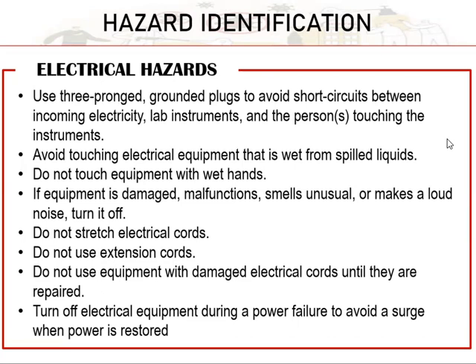I think you have already seen this one, the three-prong plugs of your gadgets and your laptops. Even for the appliances at home, that is the most ideal one to have, these three-pronged plugs.